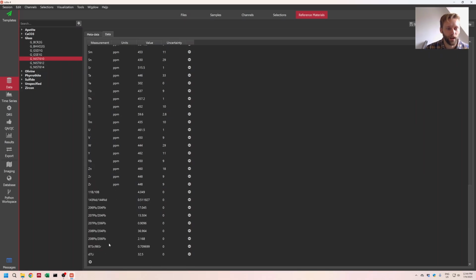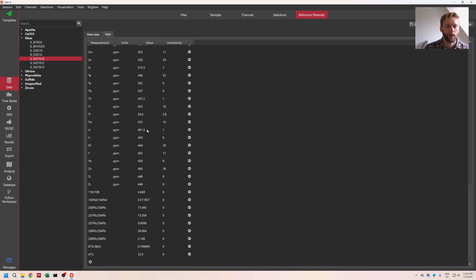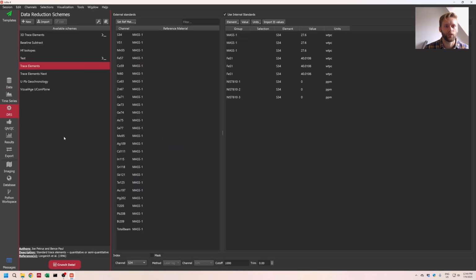But if it's not here, you can click Add, and you can add the name of the parameter, sulfur, and then you can say whatever it is. Or you can delete it. Once you have it added there, click Save up in the top right, once you add whatever new standard value you have.